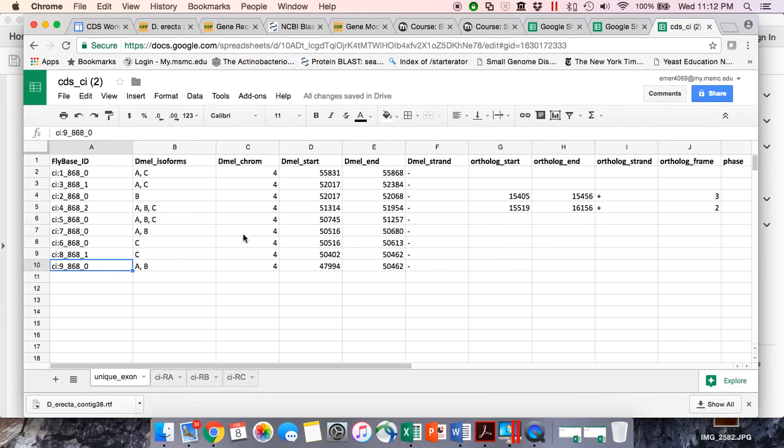And you're back. So I'm going to put in the results that I came up with. Now, I'm not actually going to fill them in the worksheet here, but I'll just put in the start and the stop sites. So you might have come up with something that looks like this.